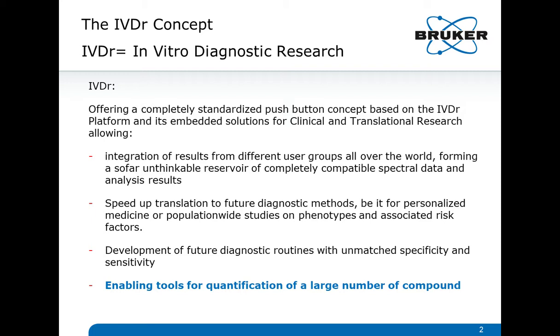And of course, it was already mentioned for biobanks, a lot of samples have to be measured, and in several cases there will be a need to have more than one of such platforms used to generate all the data which are stored. You heard about very large sample numbers, 200,000. There are also biobanks which have more than 1 million samples stored. So this is definitely a challenge that cannot be executed by a single instrument.